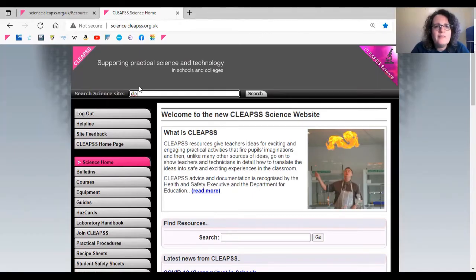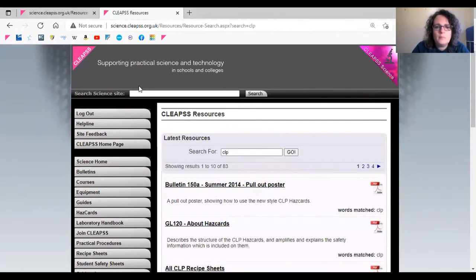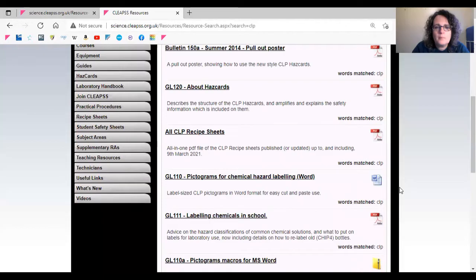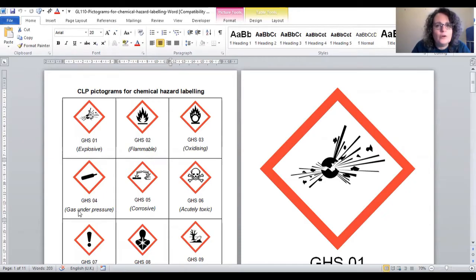You can find CLP hazard pictograms in GL110. These can be copied, resized and pasted into labels you're making, or any documents which may need them.